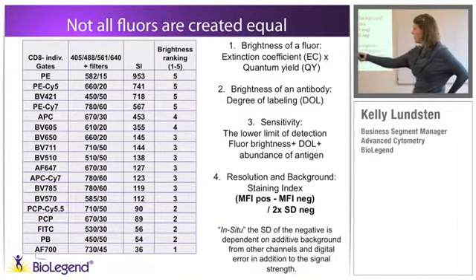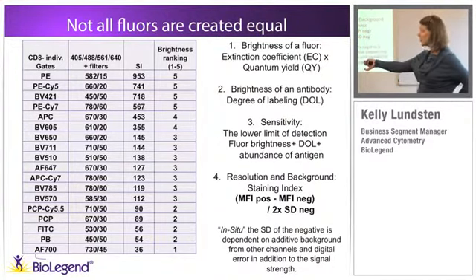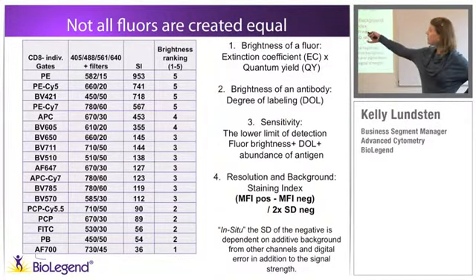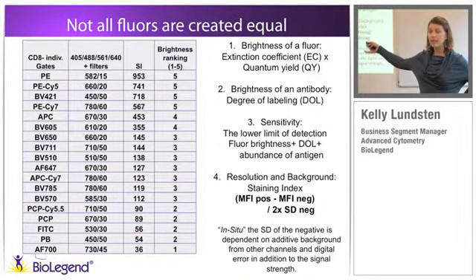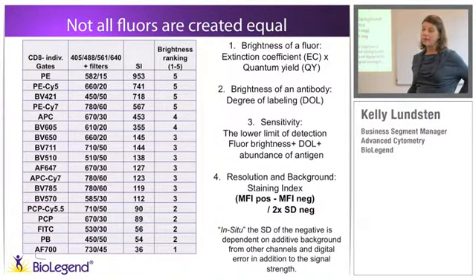For example, FITC, which is a fluorophore that we've relied heavily on for years, used to be one of the only 3 fluorophores that we could start with, 15 years ago. It's actually extremely dim. But when we have a machine like ours, where there's only 2 fluorophores that will be excited off the 488 laser, FITC is in an extremely sensitive channel that's not populating a lot of background from its neighbors. And so it then becomes bright.